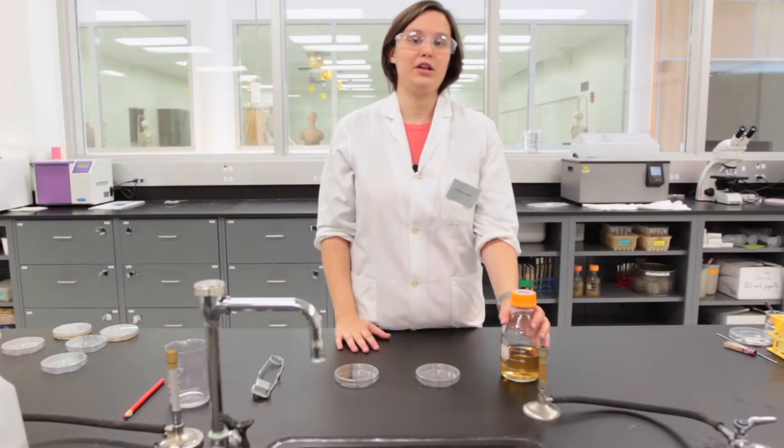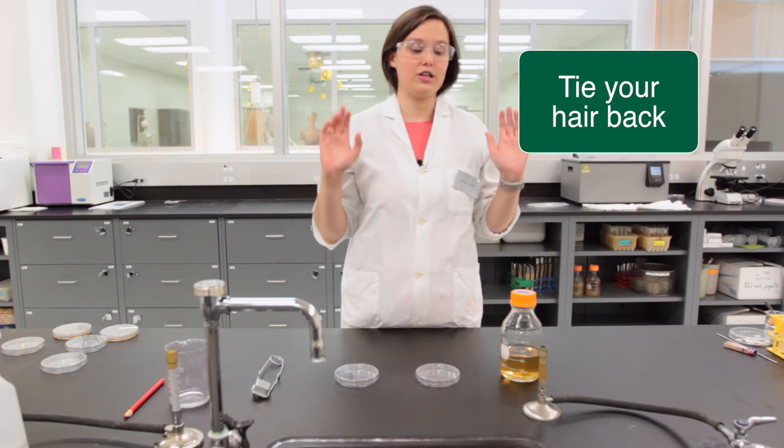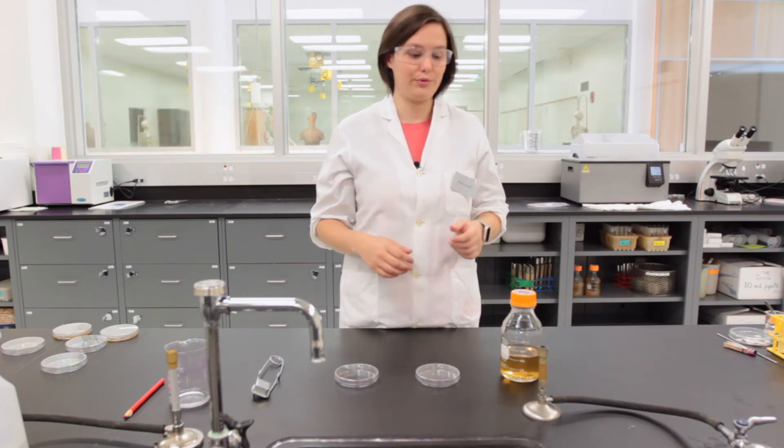When you retrieve the bottle of media from the water bath, set it down and make sure that your hair is tied up if you have long hair, or your baseball caps are turned back, so that you won't catch on fire when we use the open flame.